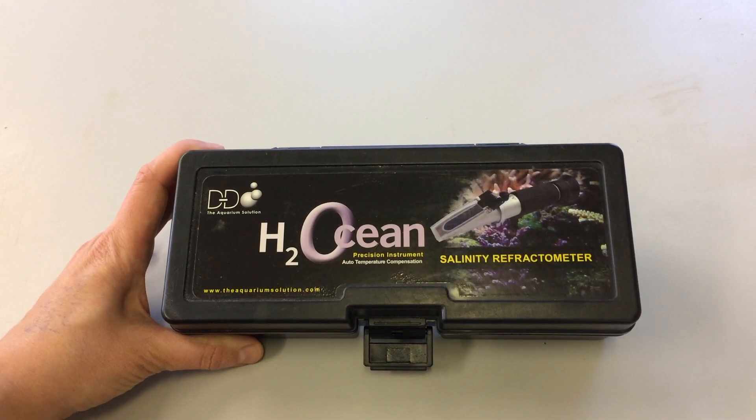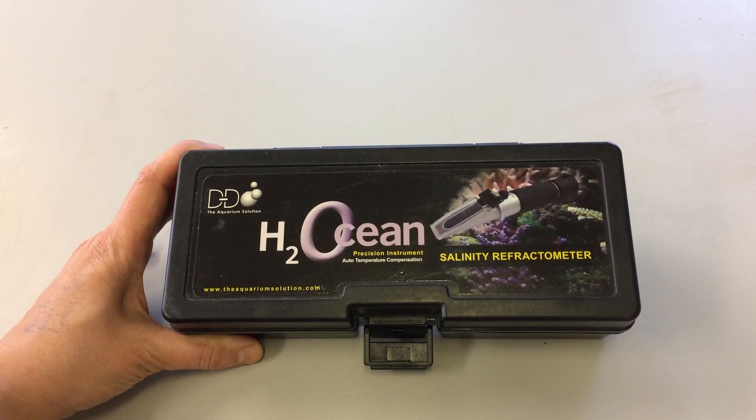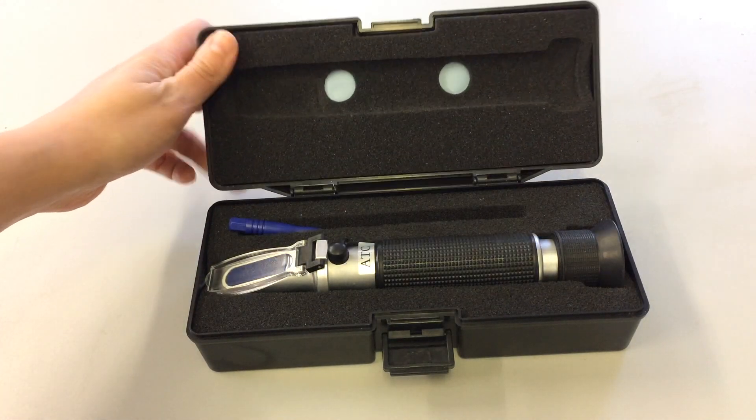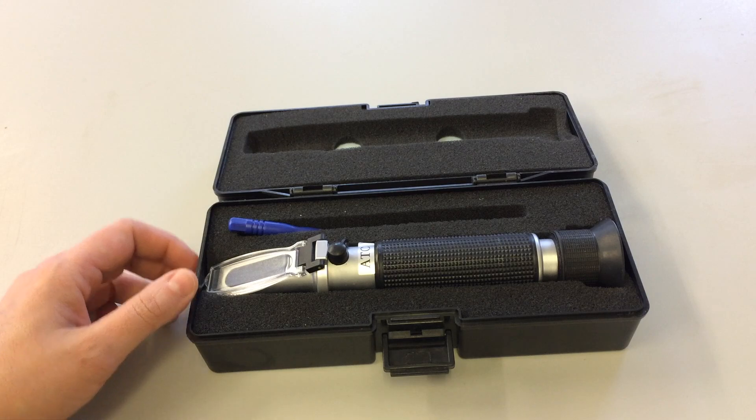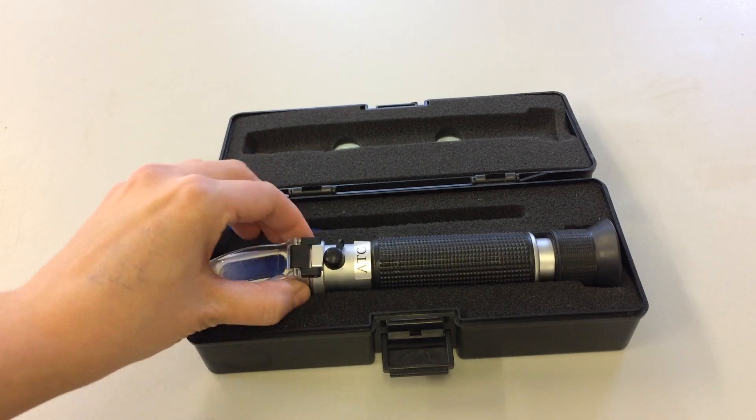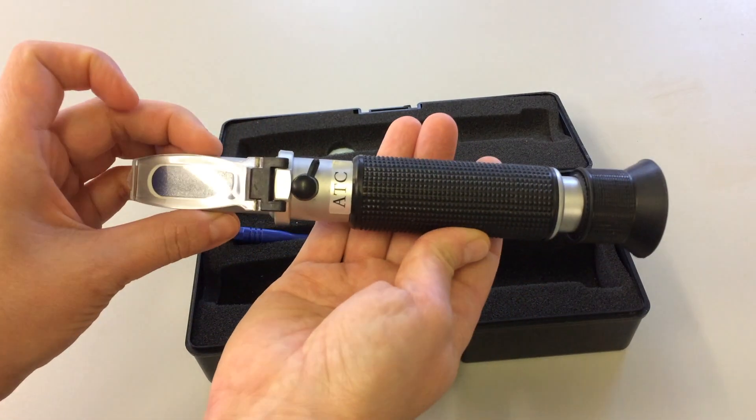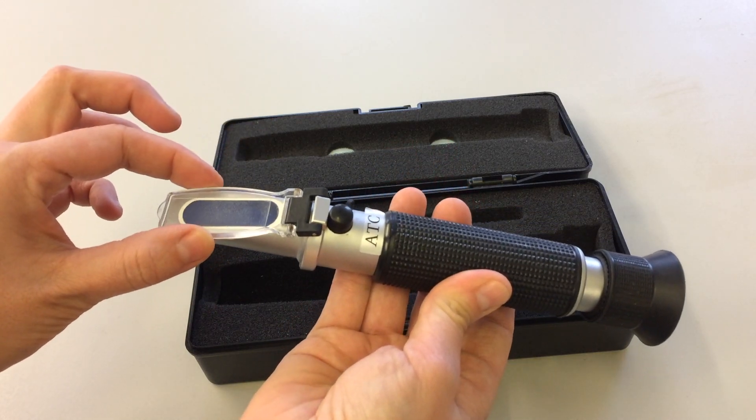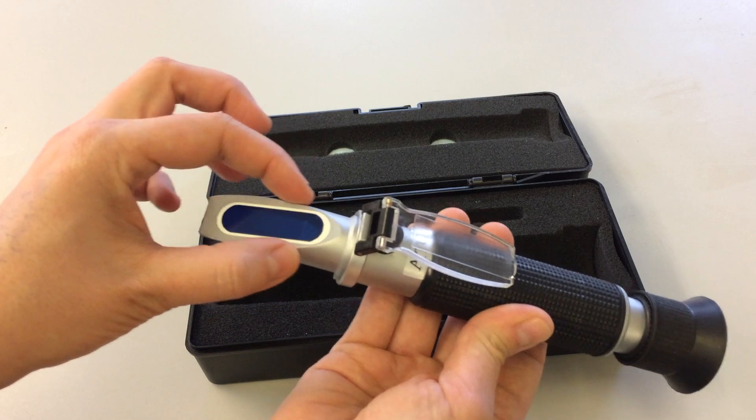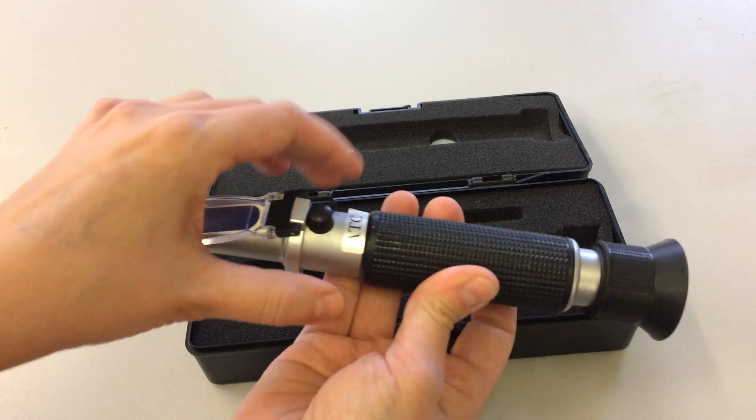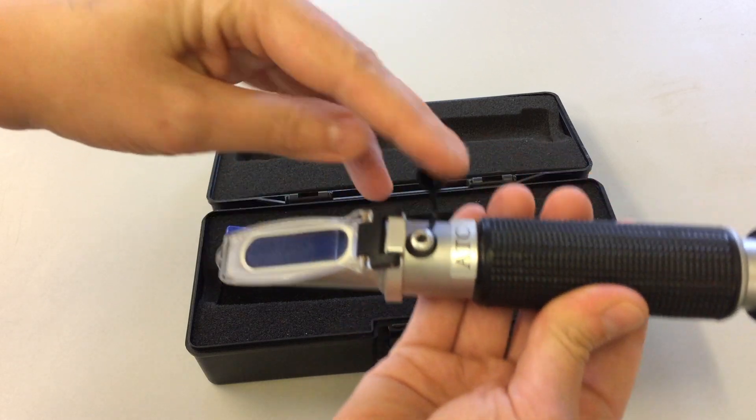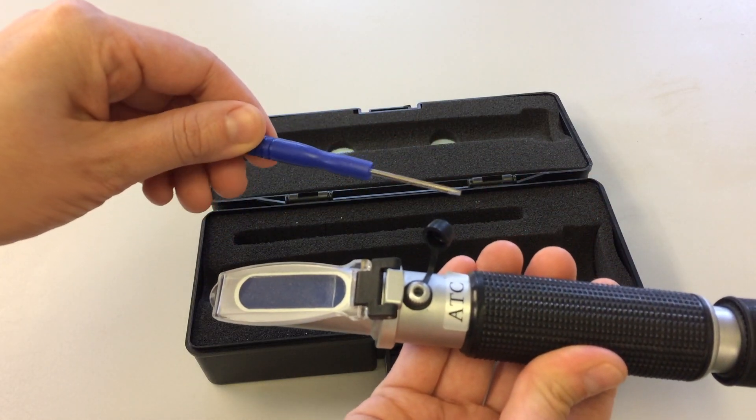Okay, here we have a handheld refractometer to measure salinity. These models are very easy to use. It's a small handheld device with an area where we can put a seawater sample on top of a glass section here. Underneath this section we have a small screw.